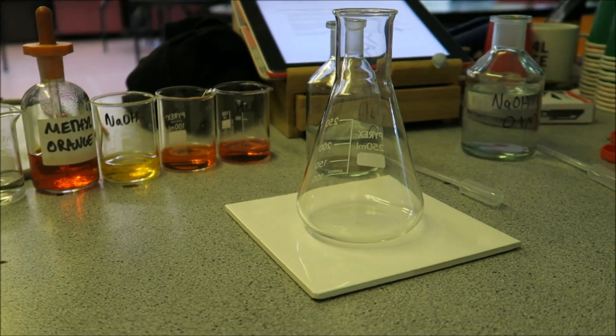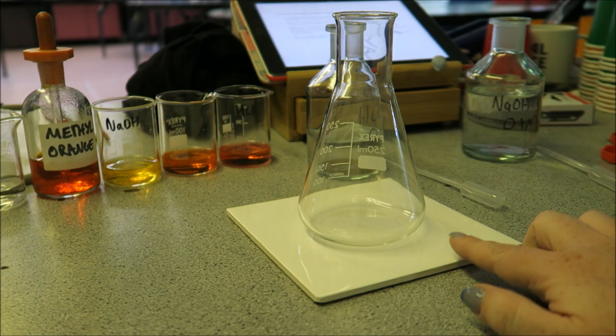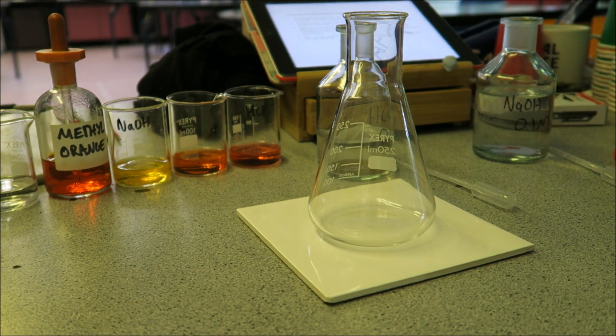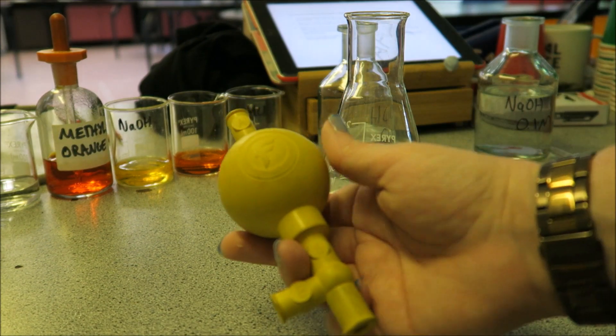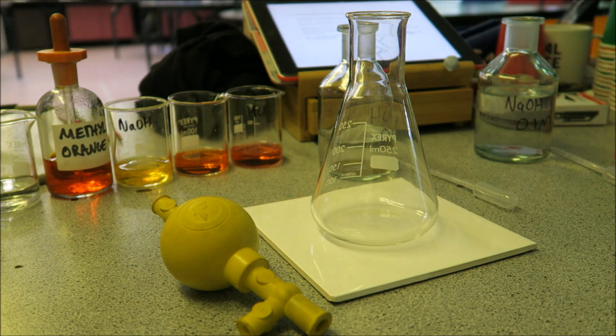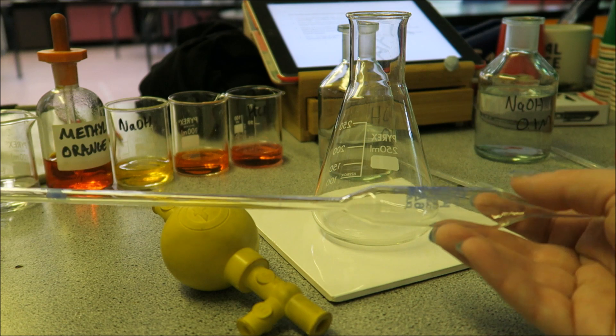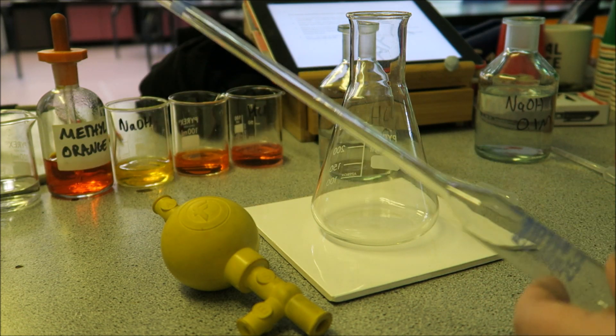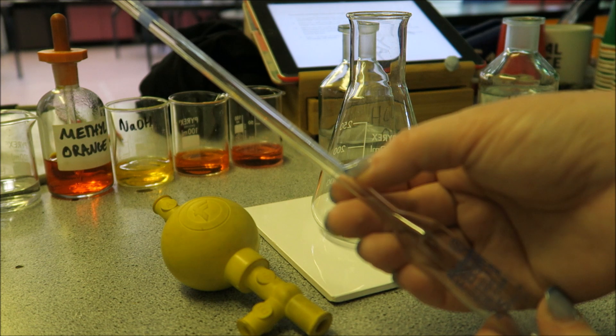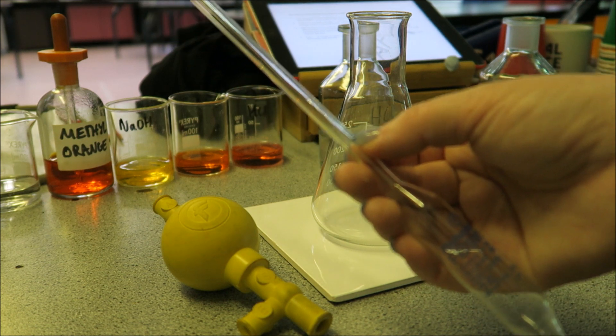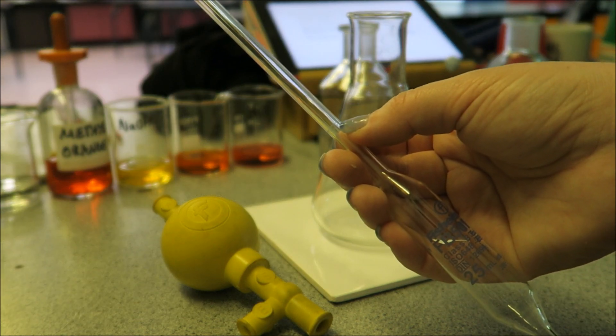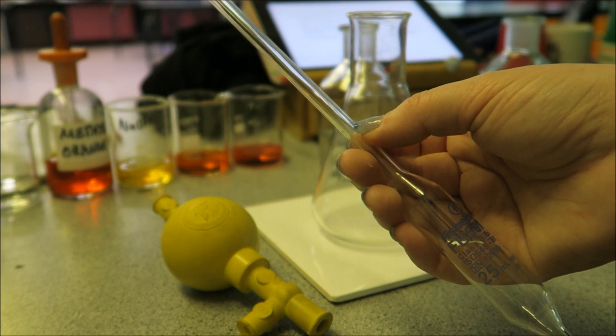The first thing I need to do is pop 25 cm cubed of hydrochloric acid in here. What we have available is a ball pipette and a long pipette that looks like this. You'll notice on your pipette there is a line just about here, and this is where we are aiming to fill the pipette to.